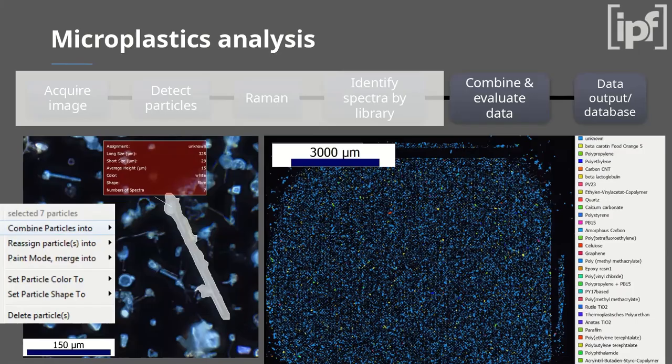And then the results can be reported, either exported as spreadsheets for all the properties of the particles, including the material that was identified, or it can be directly uploaded to a connected database.